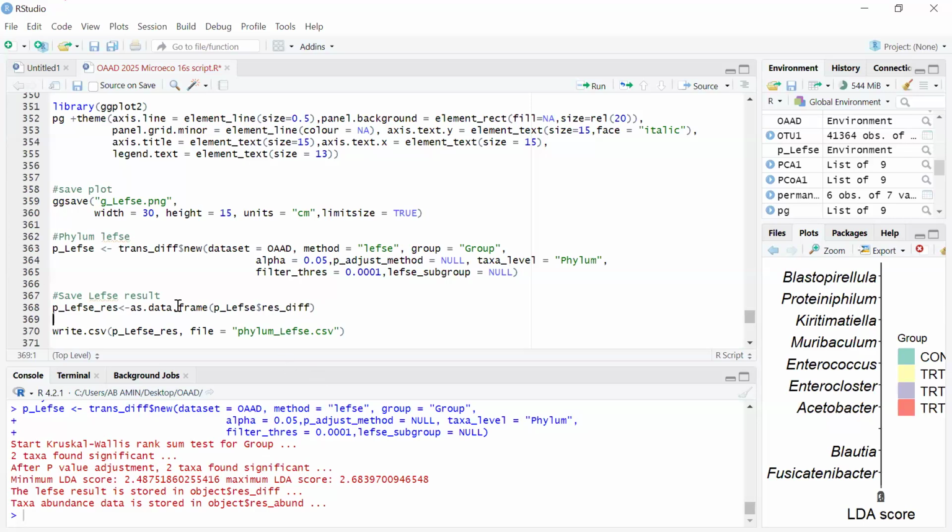So we'll have to look at this. When putting thresholds, sometimes in some articles I publish, I put a threshold for genus separate from the threshold for phylum. Because if you put a lower threshold, for genus you may find too many significant taxa, sometimes even more than 50. For you to start giving explanations for them in an article is difficult.